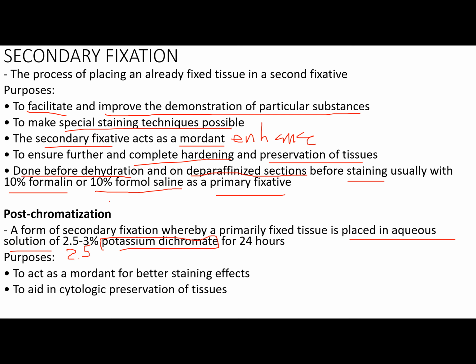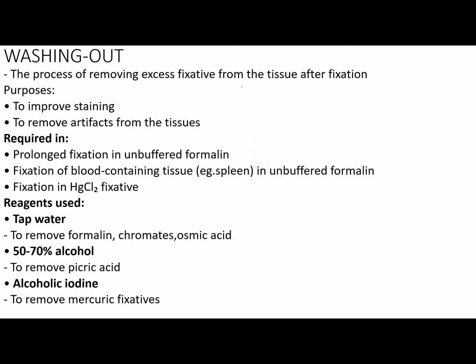Now, the purpose is to act as a mordant for better staining effect, and to aid in cytological preservation of tissue. Then we have your washing out. Washing out is the process of removing excess fixative from the tissue after fixation. So you need to wash out, class. Kailangan tanggalin yung excess fixative before you proceed with dehydration or decalcification. Now the reason why we do washing out, class, is to improve staining and remove artifacts from the tissue.